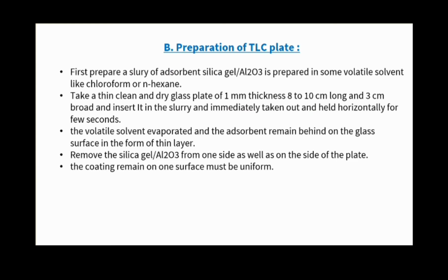We have seen principle of TLC. Now first step for performing TLC is preparation of a TLC plate. So what is the first step in this? First prepare a slurry of adsorbent, that is silica gel or alumina, in some volatile solvent like chloroform or n-hexane.